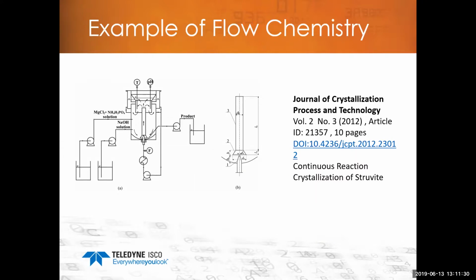That designates that those are pumping materials into a different mixing device, and out, and a pump is pushing something out into the collector. So it's a bit of a blend between flow chemistry and batch, but it's moving through there versus just sitting in the batch and doing nothing. There is kind of a combination of the two technologies.